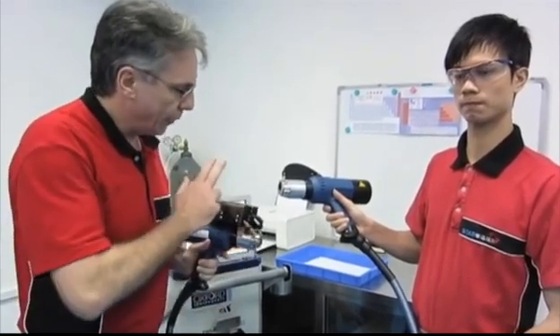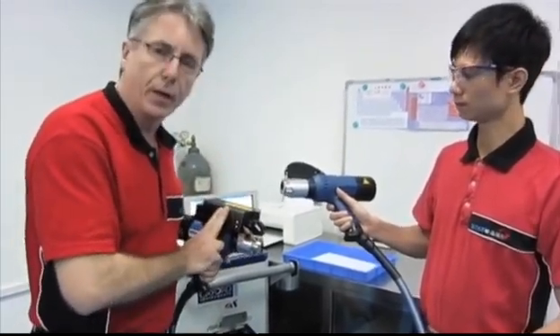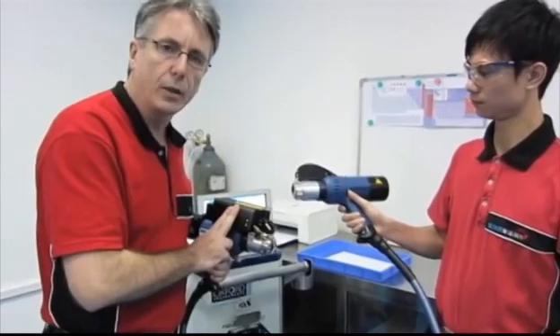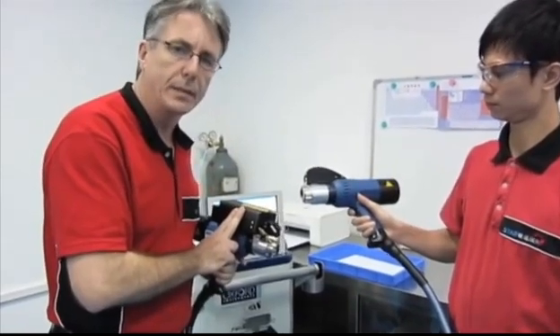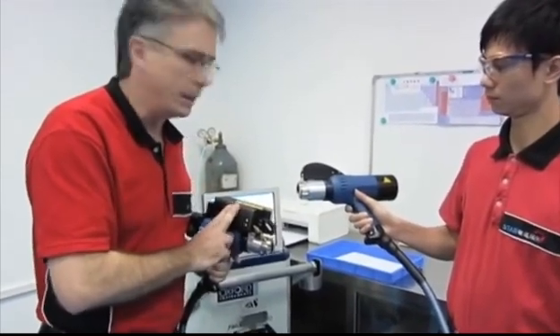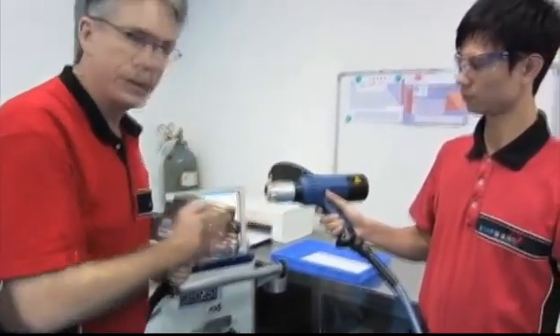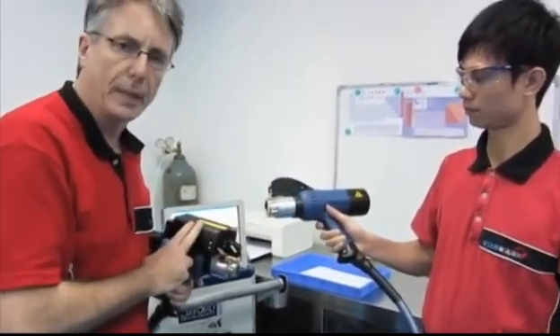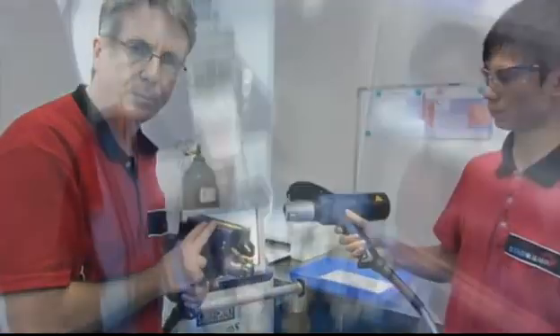We've got two guns. This one is for iron and copper based tests and this one is for all other base tests.